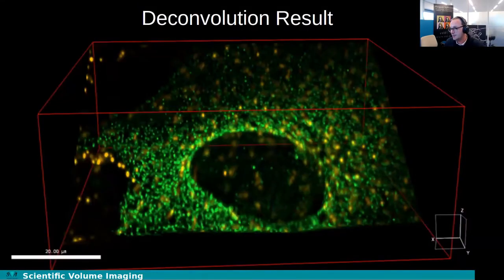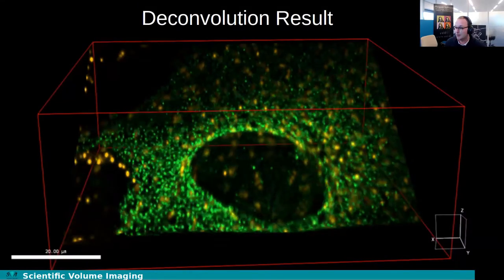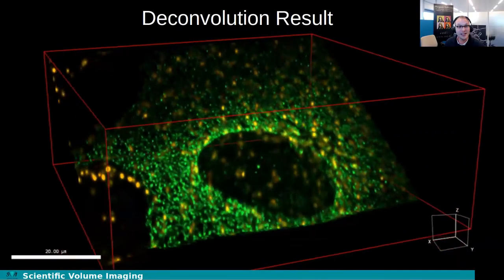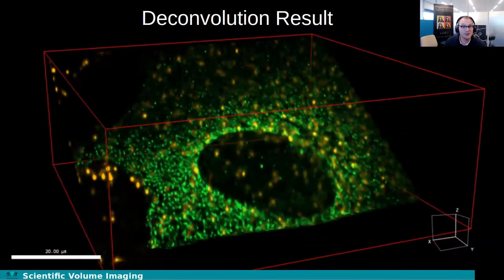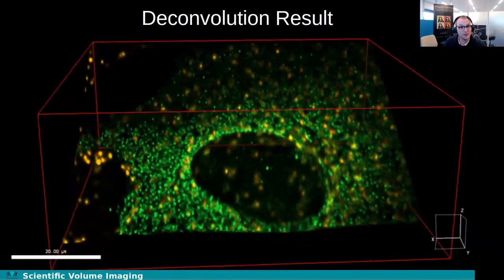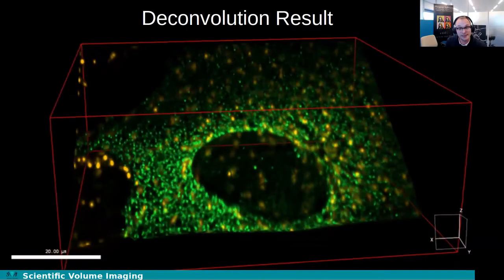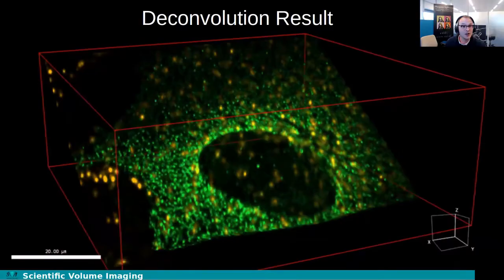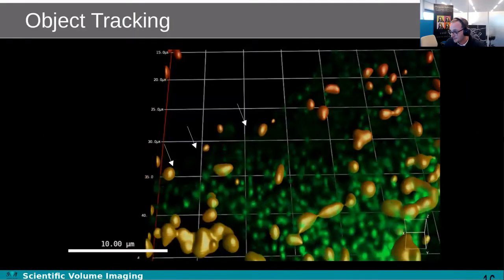And this is then the picture of that image moving with a very high time resolution, right? So if you want to capture very fast processes, but you want to capture them for a long time, you fight against photobleaching. This is a very beautiful result of pushing the limits on those frontiers.